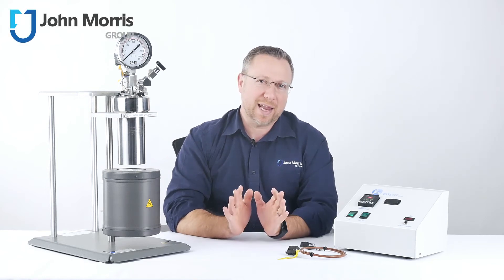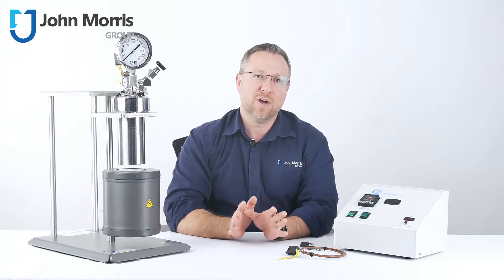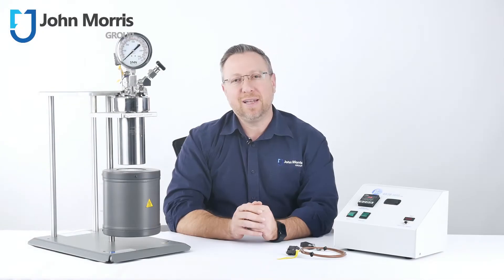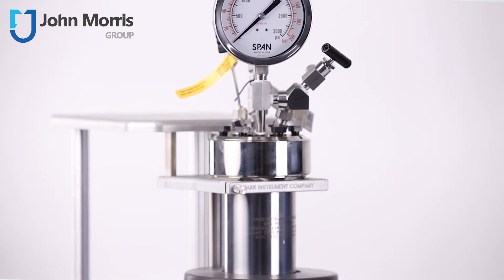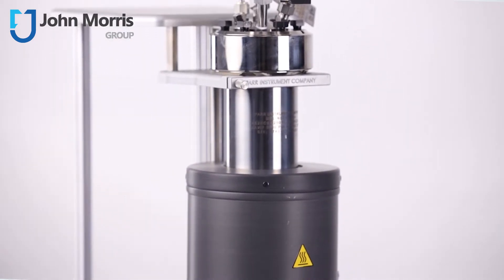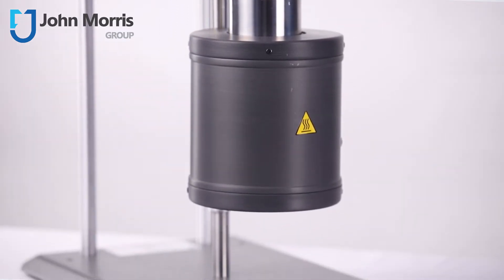Hi, I'm Warren Ray from the John Morris Group, and today I'd like to introduce the 4760 series of unstirred pressure reactors from the Parr Instrument Company. Parr was founded in 1899 and are considered one of the innovators of the modern calorimeter. Almost 100 years ago, they began focusing on specialty alloy pressure reactors for laboratory applications and are widely regarded as the leading manufacturer of bespoke high-pressure, high-temperature chemistry reactors.